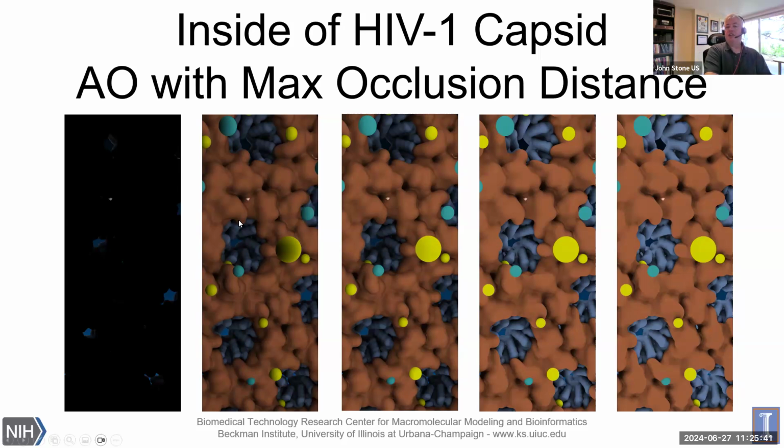And an interesting fact is if you then go further and further and reduce that occlusion distance down to a very short number, it has the impact of highlighting features at a certain spatial resolution in the structure. So if you see on the far right here, we see just these narrow crevices are shaded, or we see the shadows accentuating those crevices. So that number, this occlusion distance, can be used as a tuning knob to do things like show pockets or pores of a particular size more clearly than those of other sizes. So that's worth being aware of.